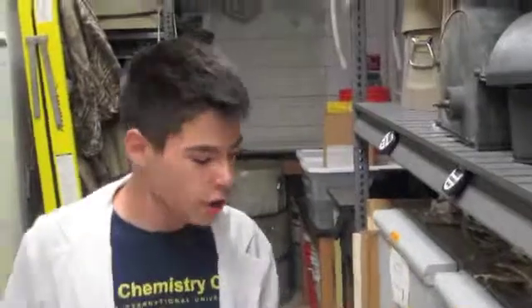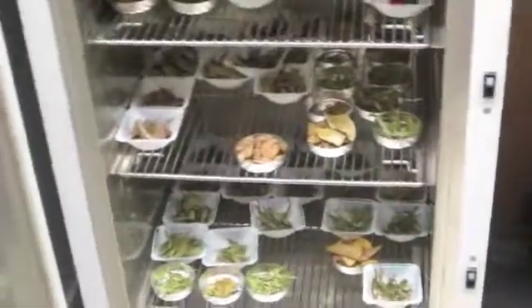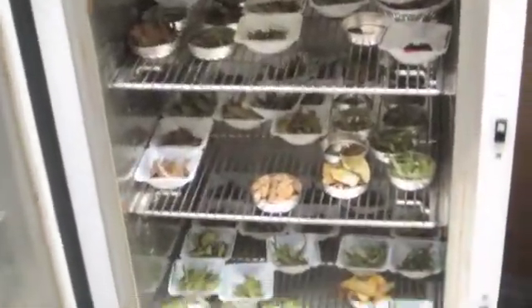Now over here we have our 3 drying ovens. We have dry only, moist / dry, and our wet oven. Now in these ovens, soil and leaf litter samples are dried so that they may be ground into a powder and, like Martin said, analyzed for total carbon, nitrogen, and phosphorus levels.